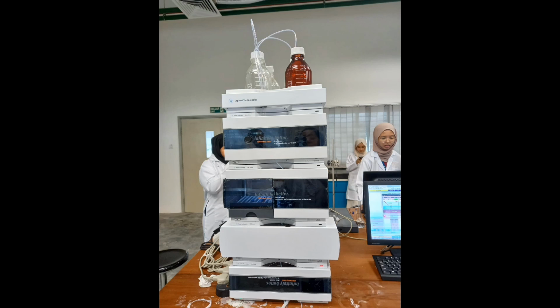Common types of stationary phase used in HPLC with RID are normal phase, reverse phase, ion exchange, size exclusion, or gel filtration. The choice of stationary phase influences the selectivity and efficiency of the separation process.